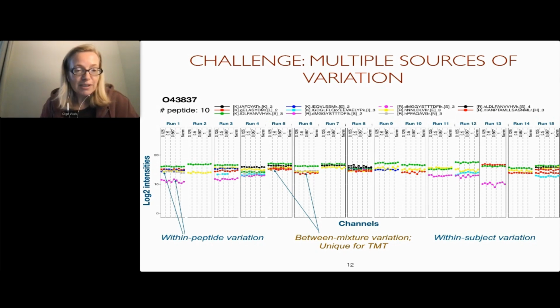And usually everything we do after log transform, because statistical modeling is facilitated on the log scale. And so what you see is that we don't have the same colors in every run, right? For example, this pink feature is somehow low intensity and variable in the first run. It is absent from run 2. It is absent from run 7, etc. Run 2 has only 2 PSMs for this protein, green and yellow, but then some other runs, for example run 15, have a lot more PSMs.